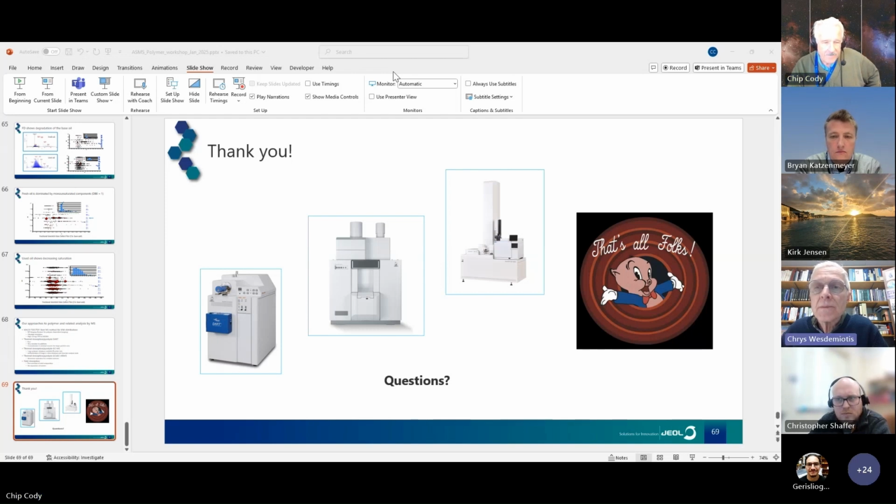It's amazing, though, that you saw acids. I would expect the acids to stick on the columns, but you did see carboxylic acids, especially the small ones. Yeah, that's actually one of the benefits of GCGC. We did a paper on earwax, believe it or not, which has all kinds of things, including triglycerides. And because you have both polar and nonpolar separation, you can actually get a much better characterization. Things like cocoa butter equivalents, you usually do those on a specialized 1D column, but GCGC is a really interesting way to try to characterize these things.